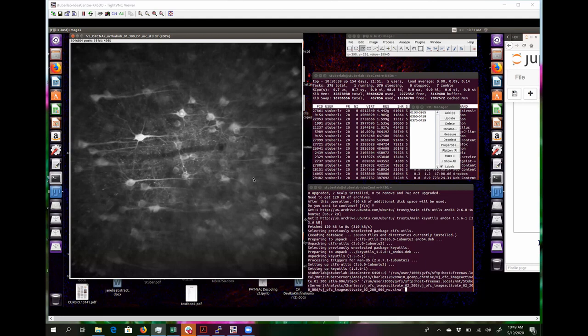And the third one that we didn't really talk about, but would be good to mention, is that I noticed the number of vertices you drew for each ROI was around 6 or 7. It could be more. The more you do, it doesn't hurt, but you don't want to draw square ROIs.